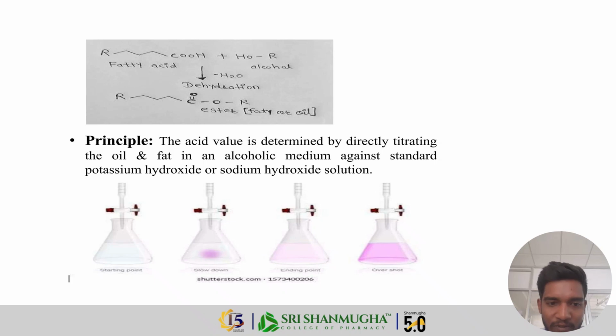Next one, the principle. Acid value is determined by direct titration of the oil or fat in an alcoholic medium against standard potassium hydroxide or sodium hydroxide solution.